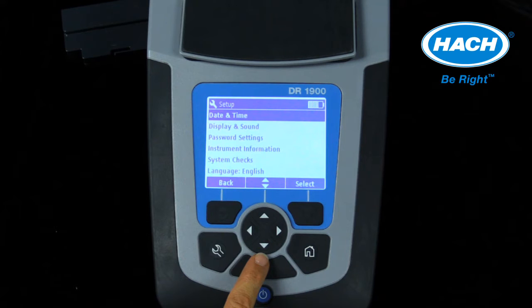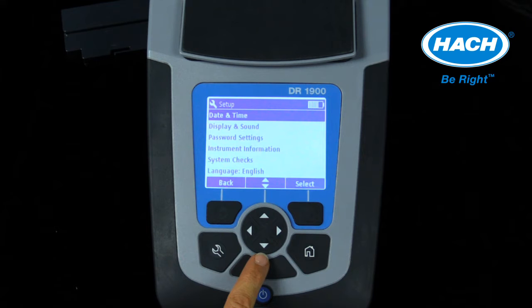This menu also provides a quick view of the instrument information, such as a serial number, software version, and memory used. The setup menu also provides the option of performing system checks on the instrument's optics.